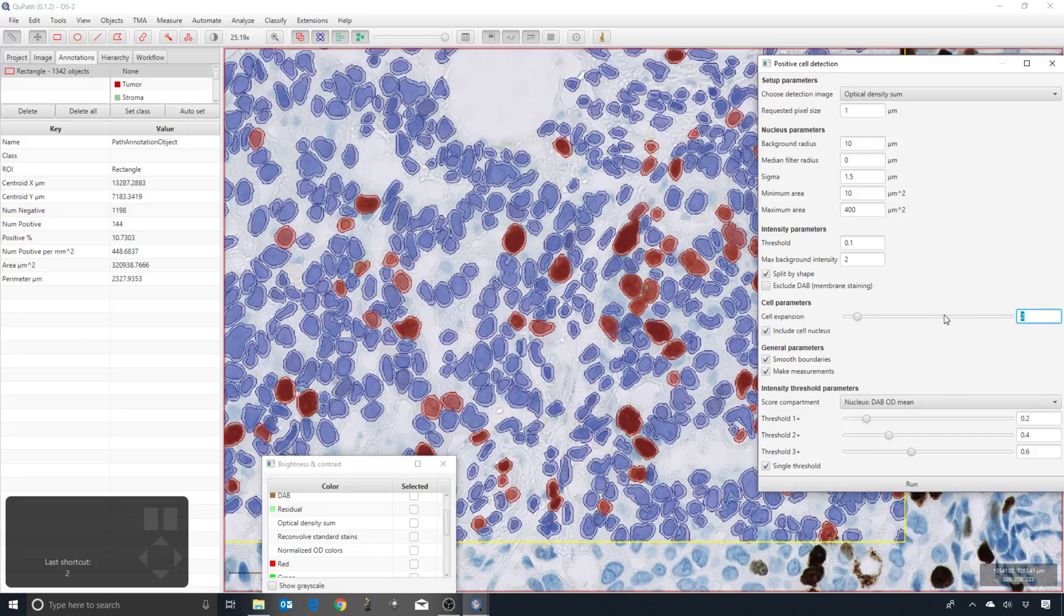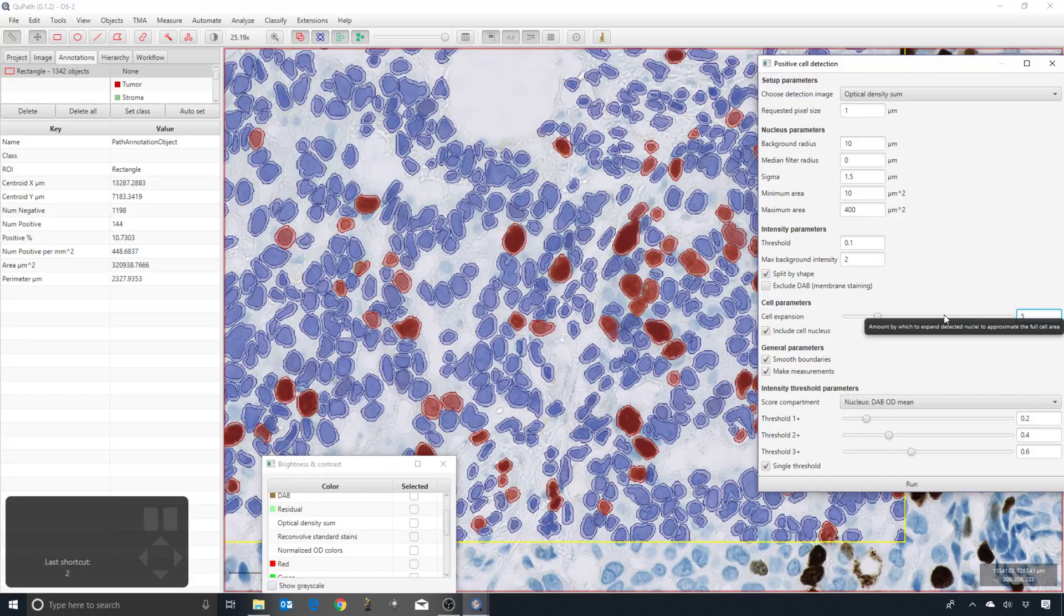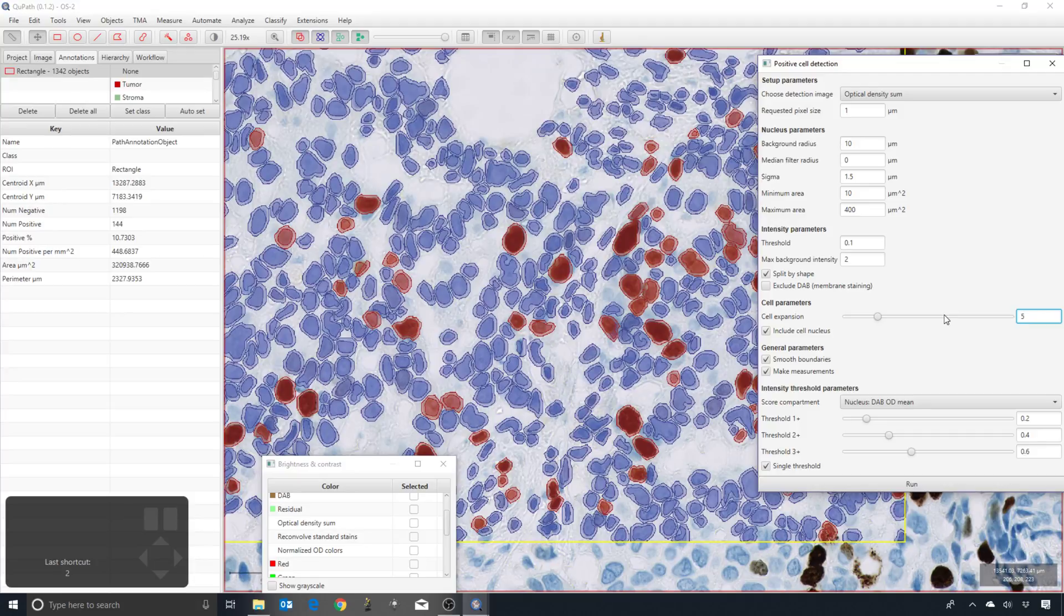However, if you're looking at only a nucleus, then when we come to classifying the cells, it's beneficial to make some kind of estimate, some kind of cell expansion, so we have some estimate of the cell boundary.